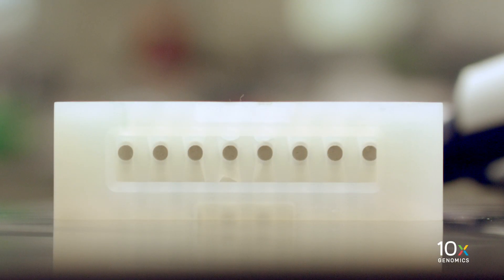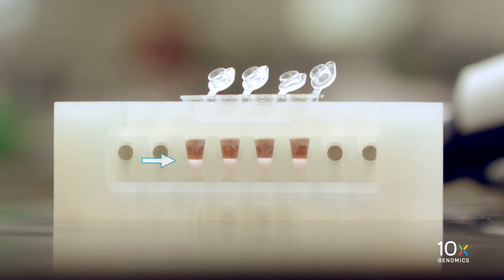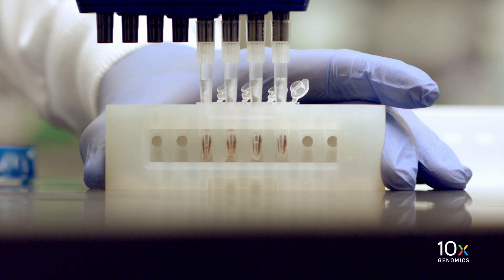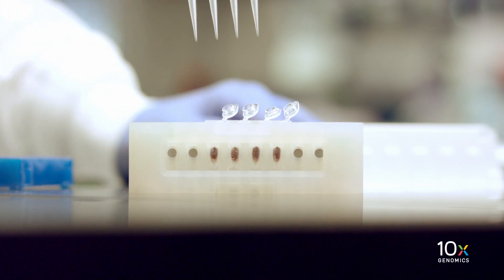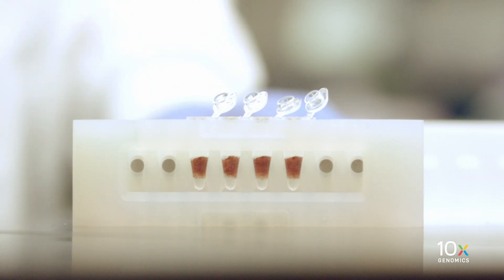After the 10-minute incubation is complete, place the tube strip into a 10x magnetic separator in the high position until the solution clears. A white interface between the aqueous phase and recovery agent is normal. Carefully remove and discard the supernatant. For the ethanol washes, always use fresh preparations of 80% ethanol. Add 150 µL of 80% ethanol twice to the pellet while on the magnet, for a total volume of 300 µL, and let stand for 30 seconds.